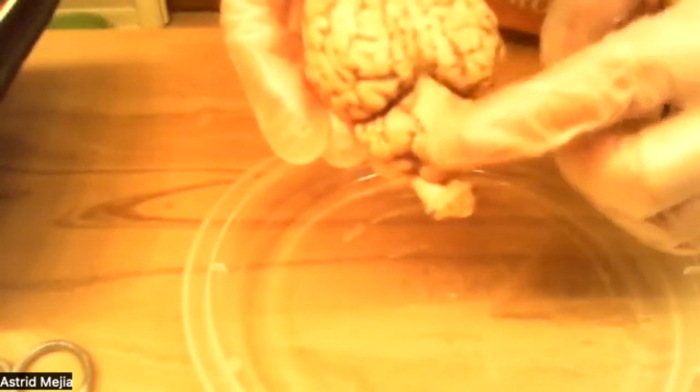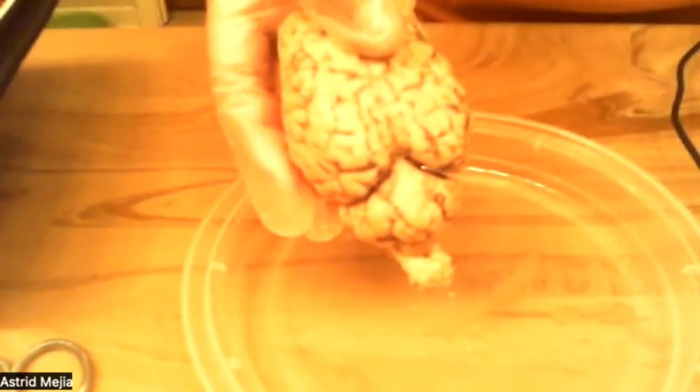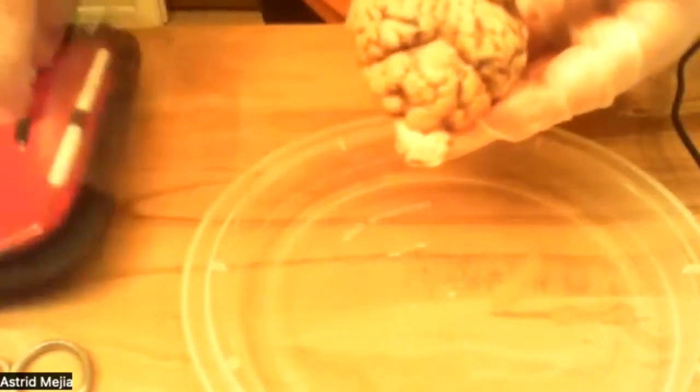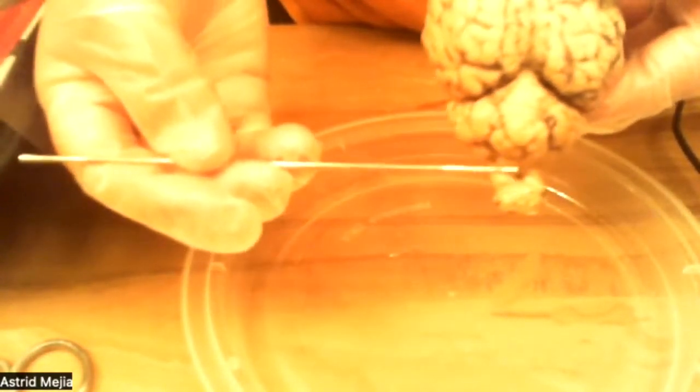So this is the cerebellum, and then this would be the medulla, which basically is where the brain and the spinal cord are going to connect, and it helps conduct the nerve signals to and from your body, and it also helps control the vital processes like your heartbeat, breathing, and blood pressure.